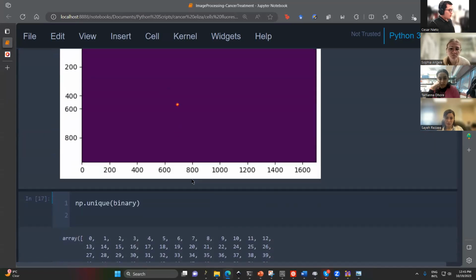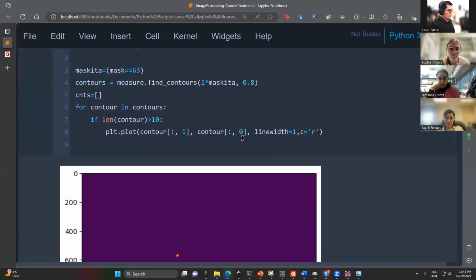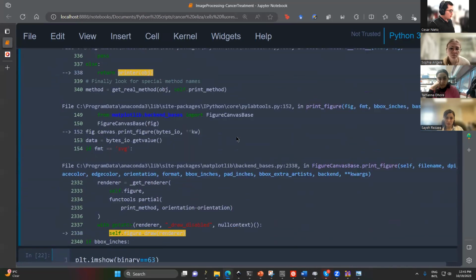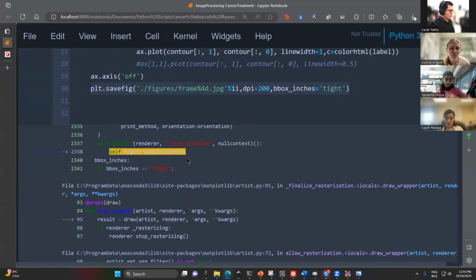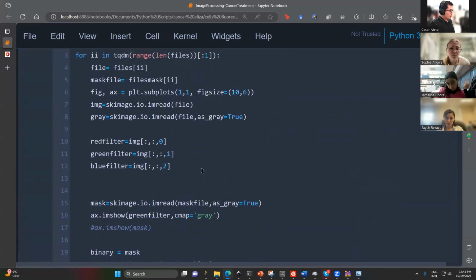Okay. So here, for plotting the video, I stopped this.